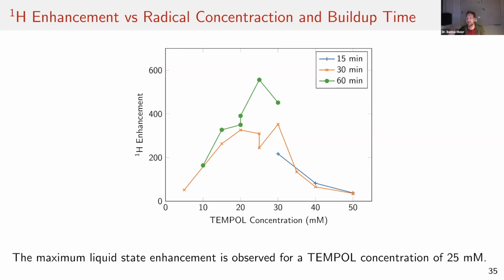So basically, there are lots of sensors on that system. But for example, what happened a few days ago was that the pressure in the drive unit was a bit too high. And then one bullet was traveling a bit too fast, and it got jammed in the injection device. And then the system now recognizes that the bullet didn't come out, so there's a detector there as well, and then it stops.